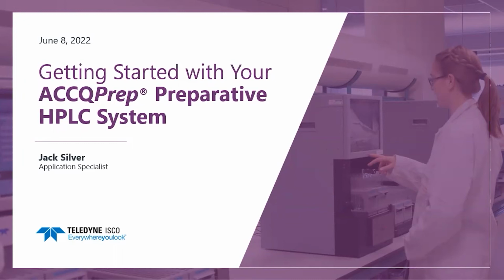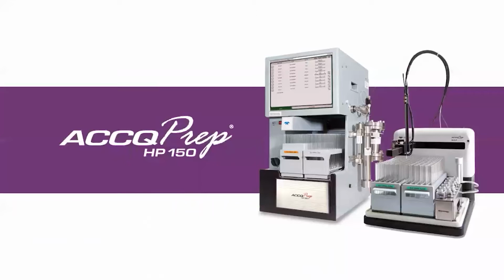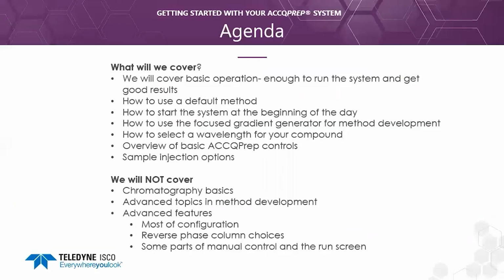Thank you, Sharon, and I want to thank all of you for joining our webinar today. Today, we will talk about how to get started running your ACCQPrep HPLC system. You will notice some controls and features in the various screenshots that I do not mention. These are advanced controls and will be discussed in a future webinar. We also will not discuss troubleshooting or solving problems. We will only discuss how to get the system running.